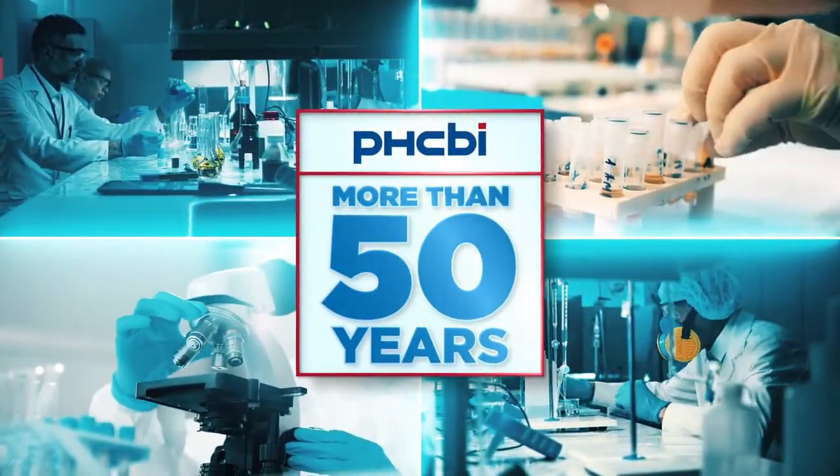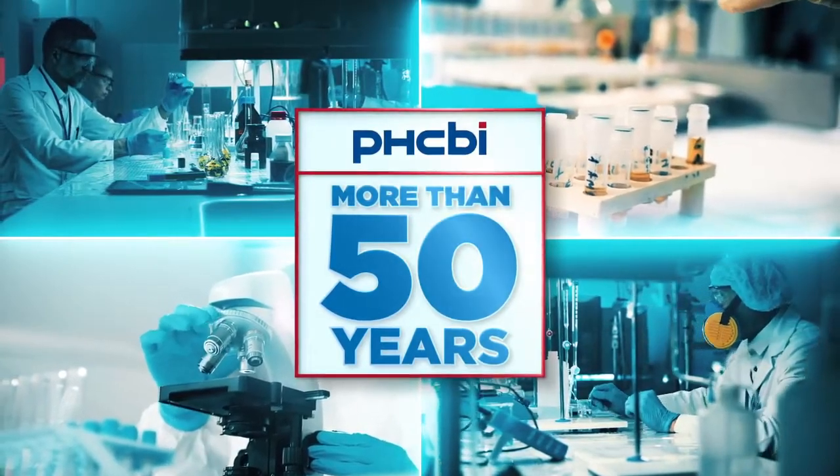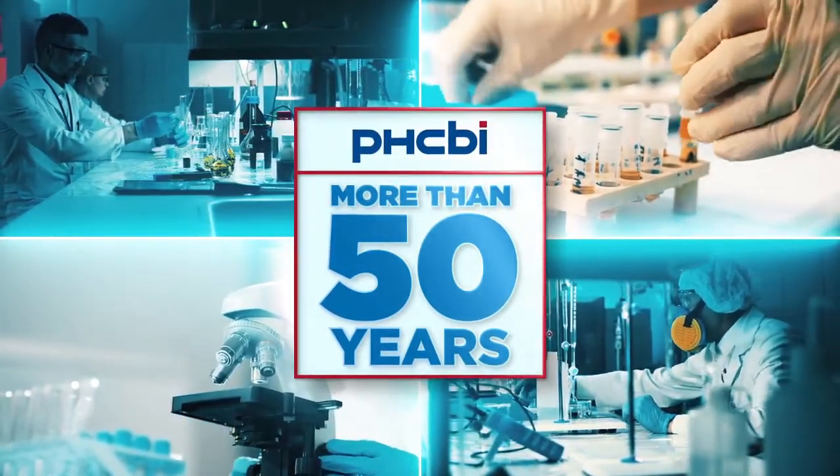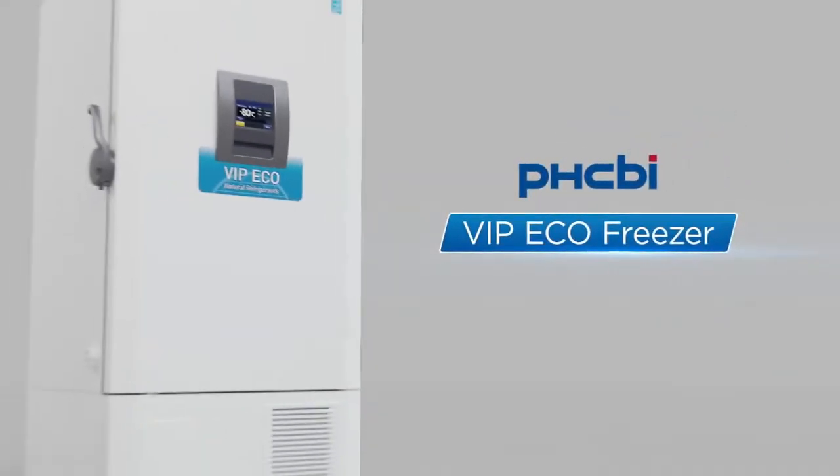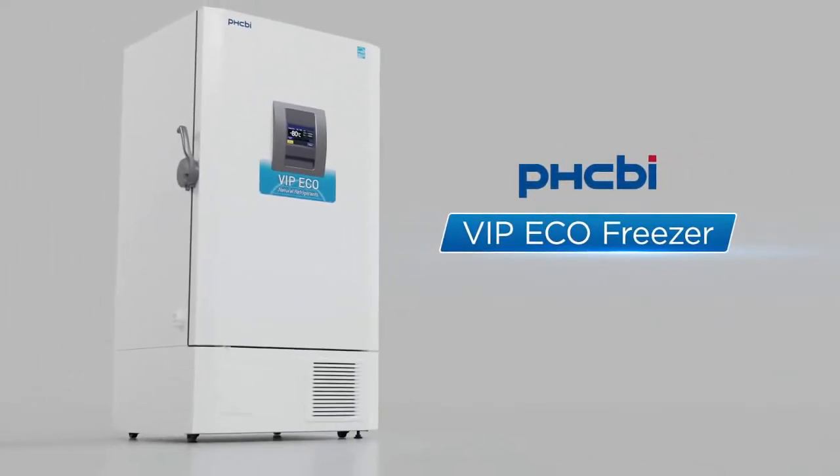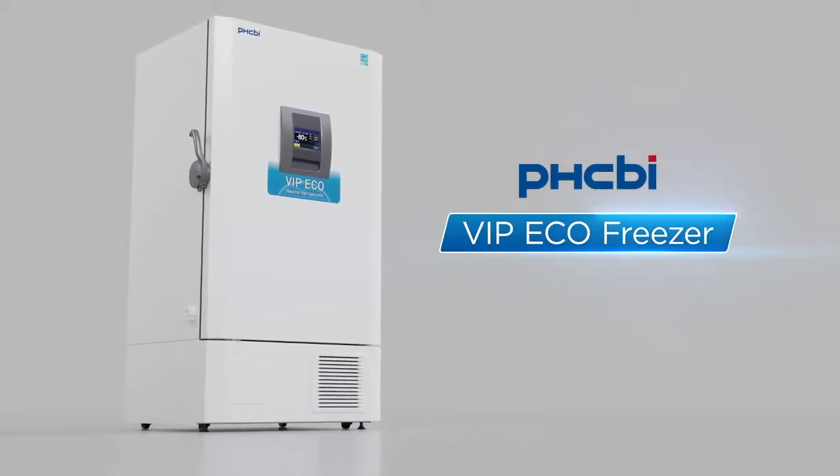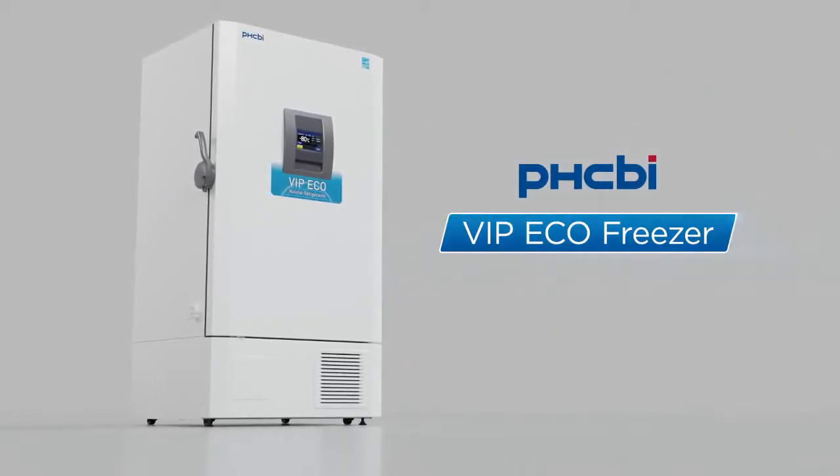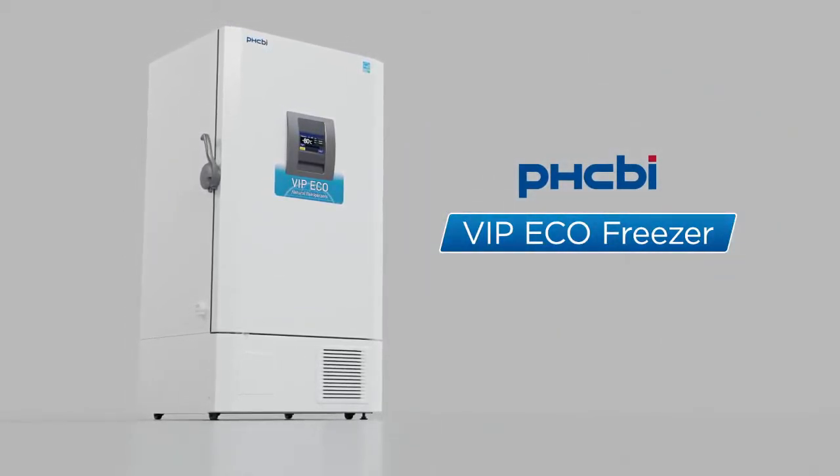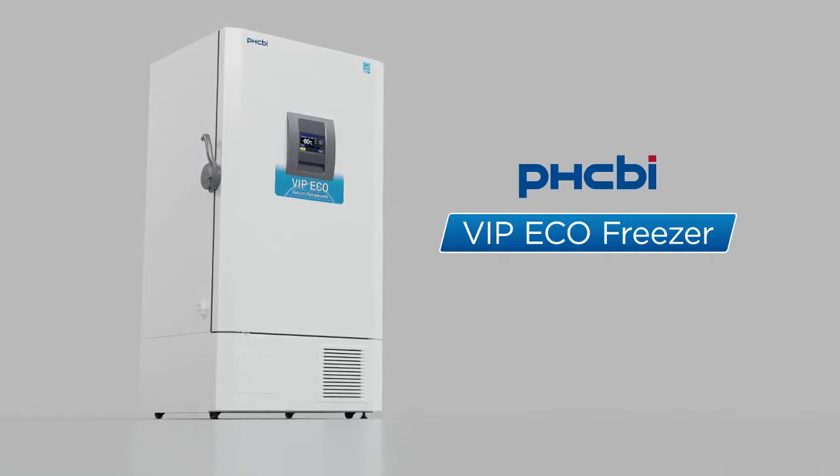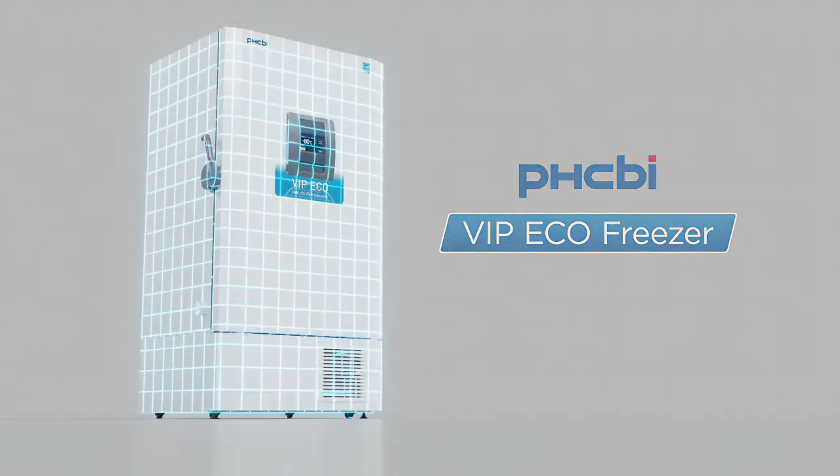Meet PHCBI brand products VIP eco, the freezer featuring an optimal purpose-driven design, top to bottom.